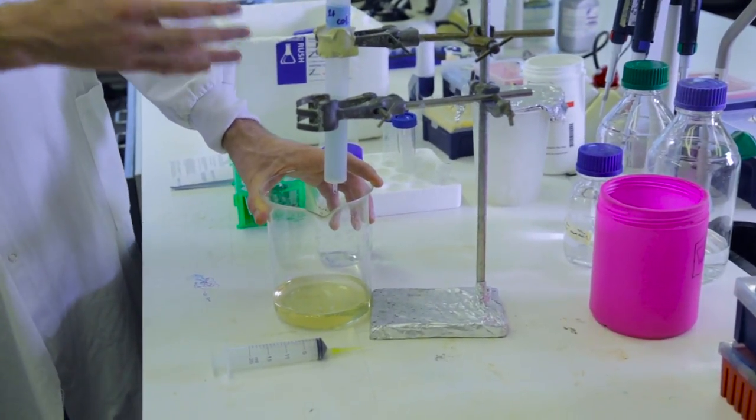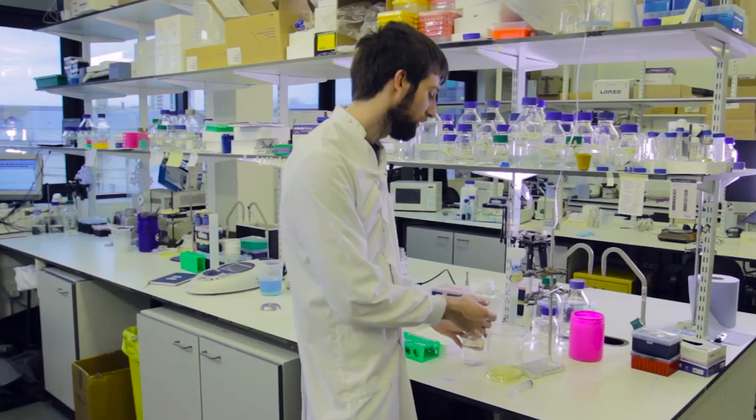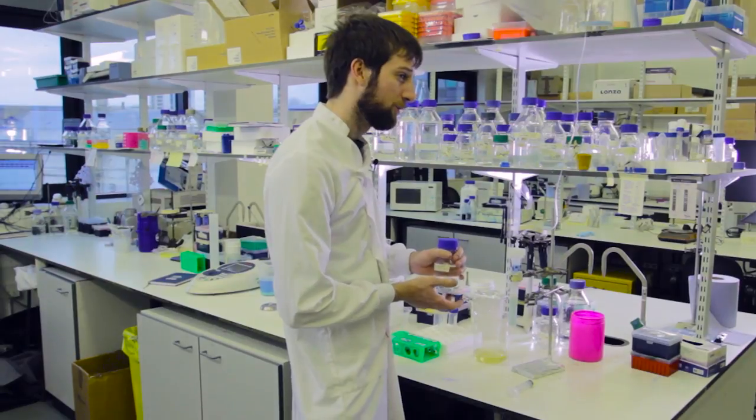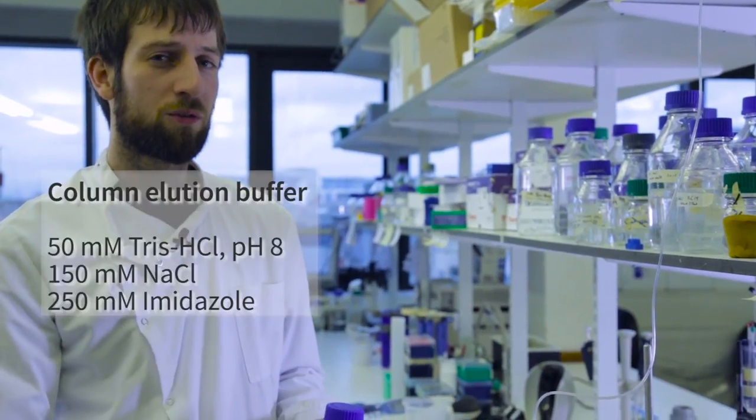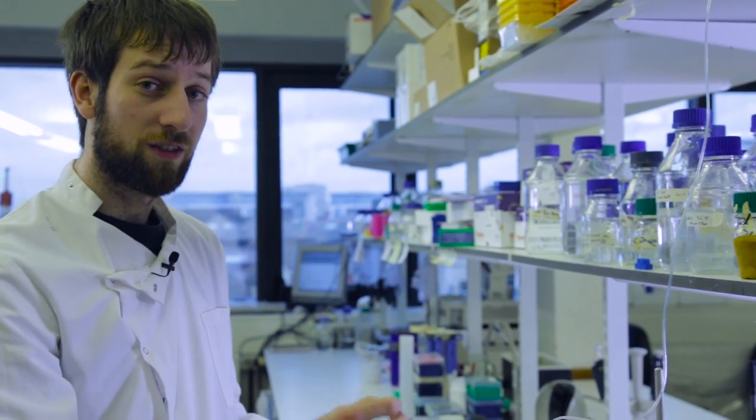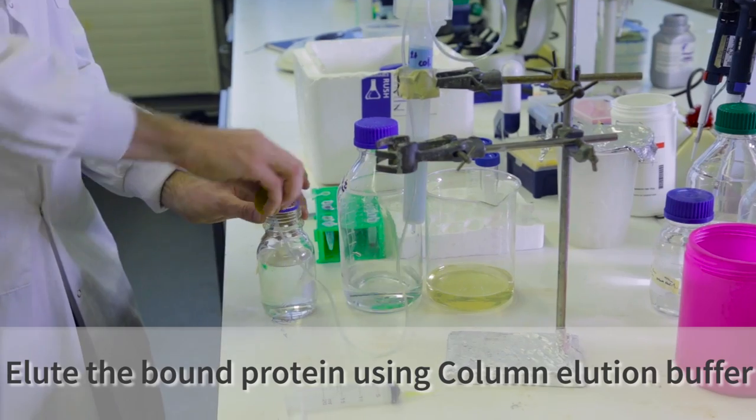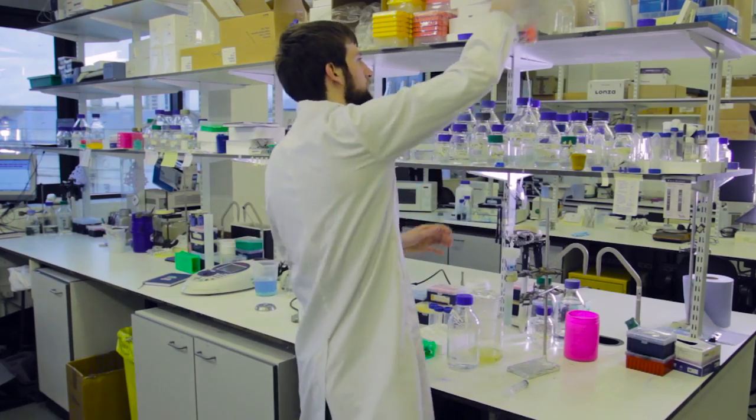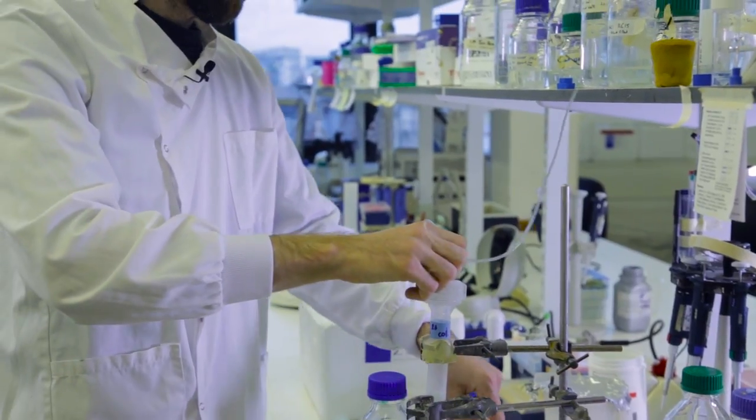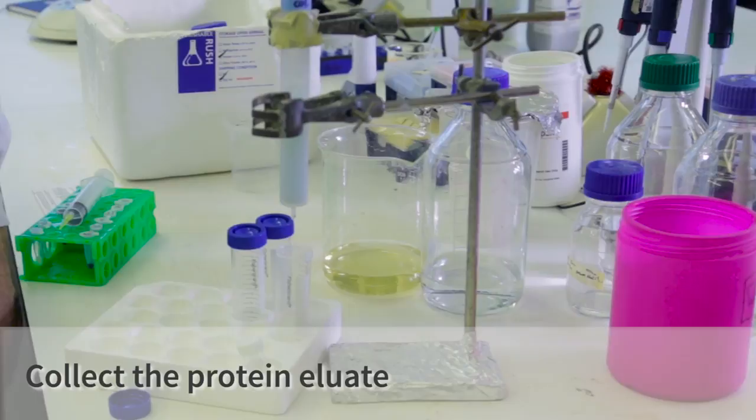So all that's left is our protein bound to the nickel resin. We need to elute it off the nickel resin. We do this using our elution buffer. Now the elution buffer is the same as wash buffer, but it contains 250 millimolar of imidazole. Now imidazole displaces the histag from the nickel, allowing our protein to flow off the column. Now we want to capture the protein as it comes off the column. We do this in these tubes.